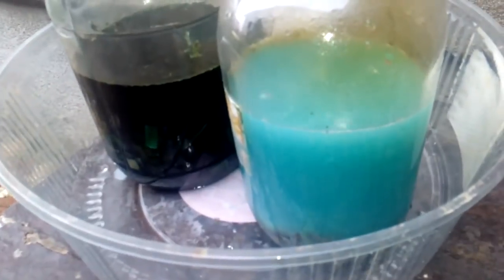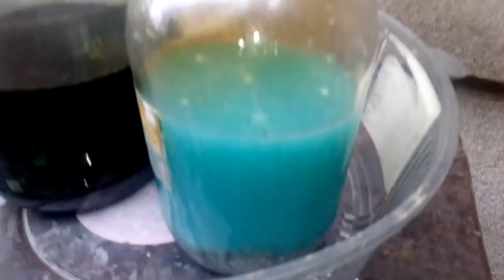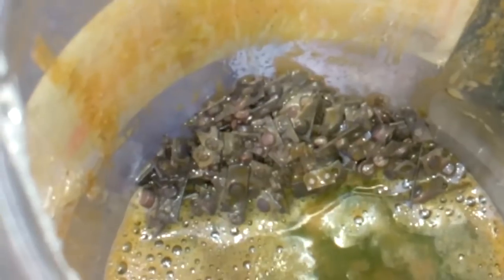Now we are going to leave this nitric acid to remove all the base metal and absorb all the silver. After the reaction is done, we start to filter this solution. We still have a lot of work here with the new batch — it's not only copper, we also have some yellow slug which makes this work harder. We will keep this nitric solution because it contains some silver, and we will add a new batch of nitric acid.